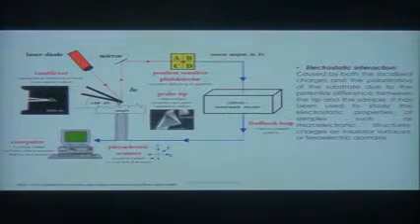Just by slight variations. And in that case, you're not moving something by atomic distances even. You could move it by subatomic distances just by slight changes in the voltage, where you're changing the spacing between the atoms in the piezoelectric material. Okay.